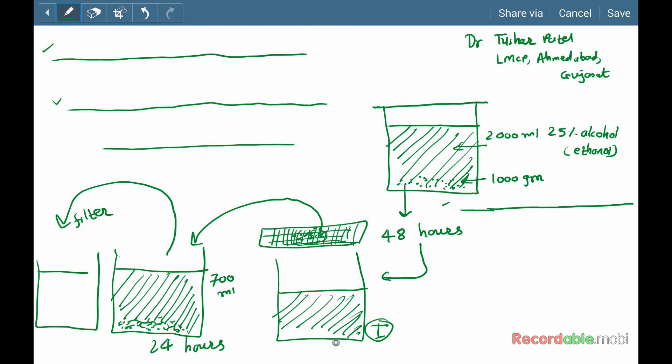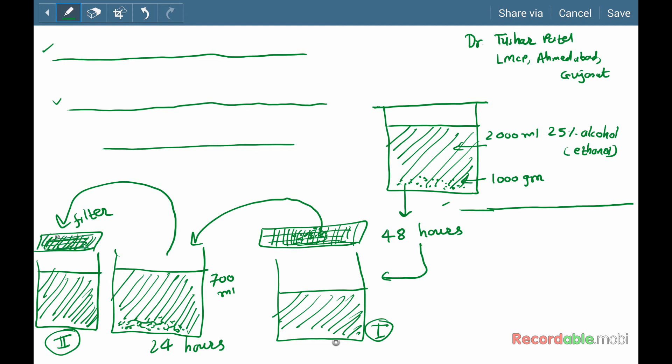Filter the solution. This is filtrate number two. Press the marc. Collect the filtrate number two and mix the filtrate number one with filtrate number two.